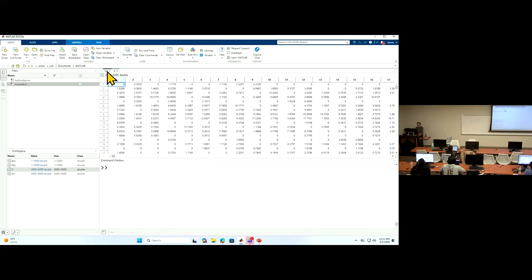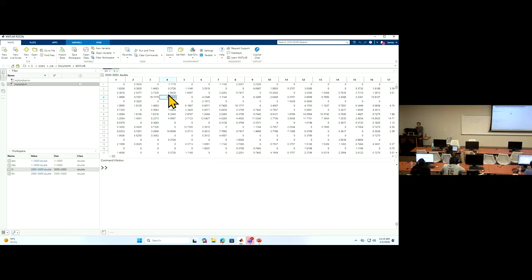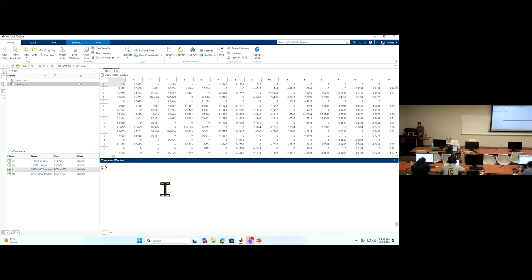If you look at this normalized version, the number for gene 4 in that cell is 24, which is much larger than the others. So everything is still proportionally enlarged or decreased proportionally. The only change is normalization by library size. Okay, so this is library size normalization.